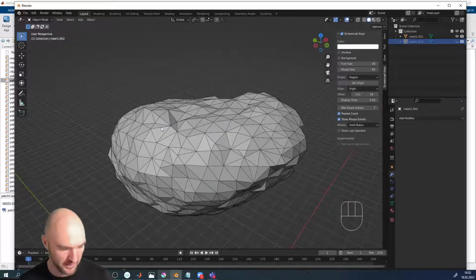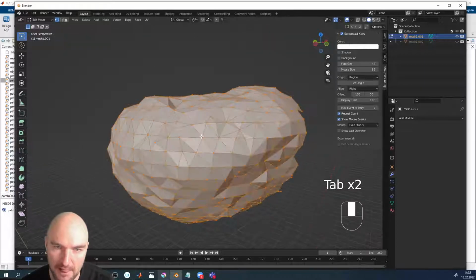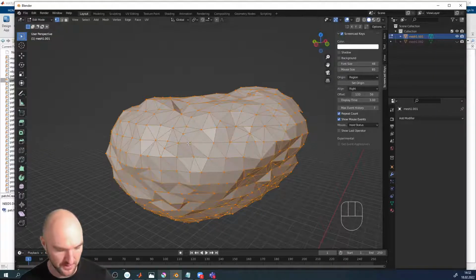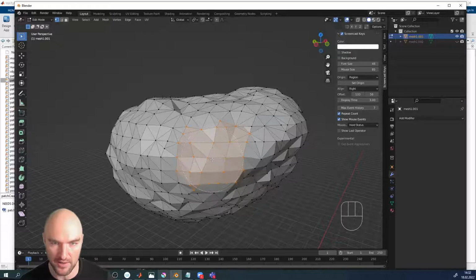So I'm going to go back into edit mode, and I might want to have a certain region here that I want to create a proxigram for example, or later on an interfacial excess value for. So I'm going to go Alt A, deselect everything, and then C, circle select, and just select a certain area on my mesh here.